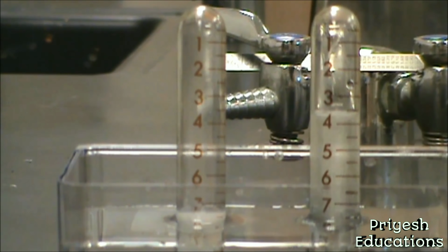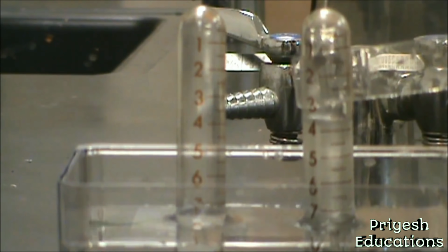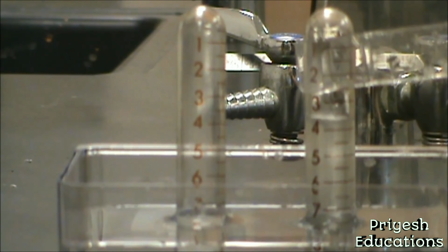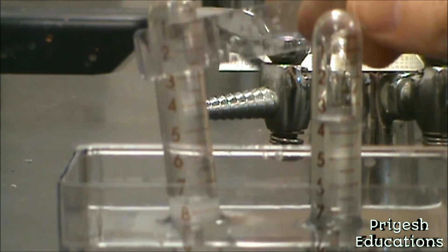So let's go ahead and make a measurement here. We're going to start by unclipping this, that way our reaction will slow down and stop. We'll let some of those bubbles collect. So we're going to tip this over. Now you're in a little bit of a parallax there, so this is currently reading about 3.7, 3.8 milliliters for the smaller of the two.